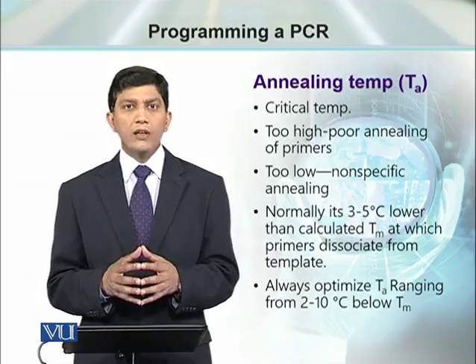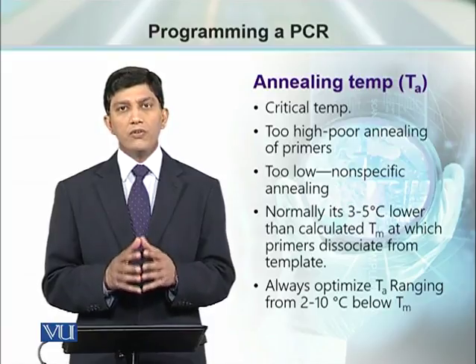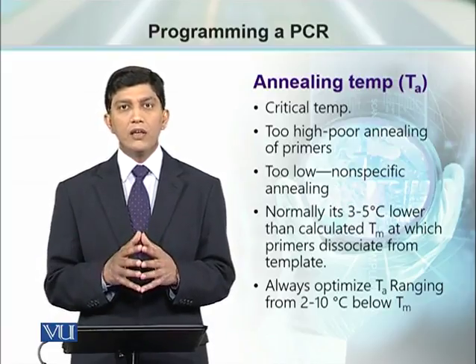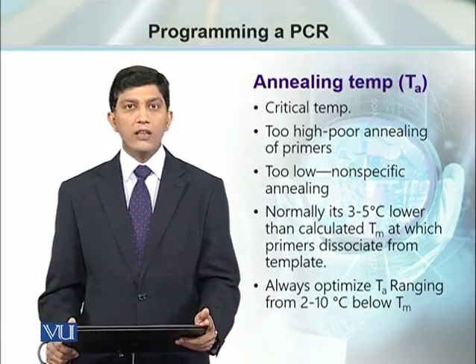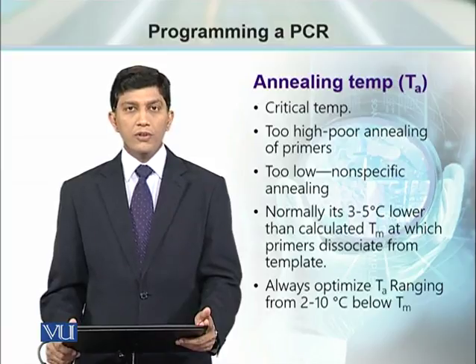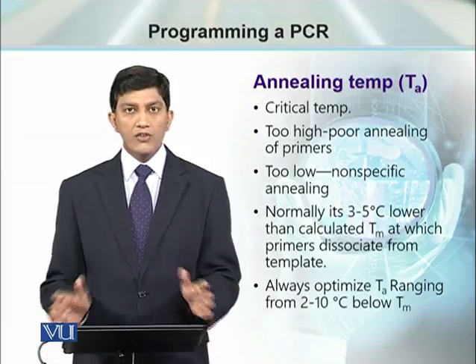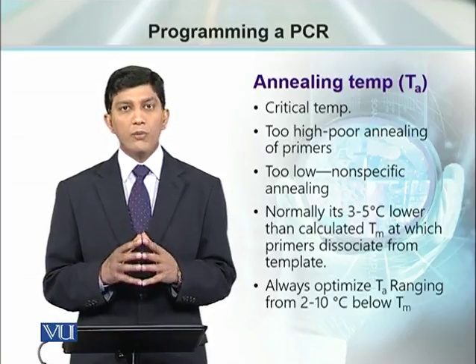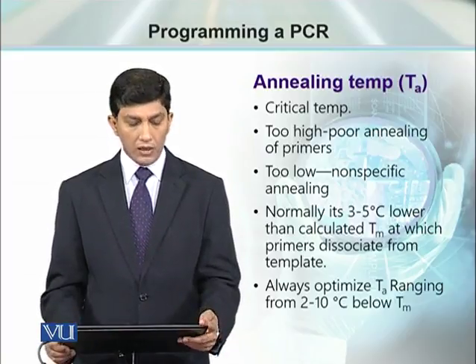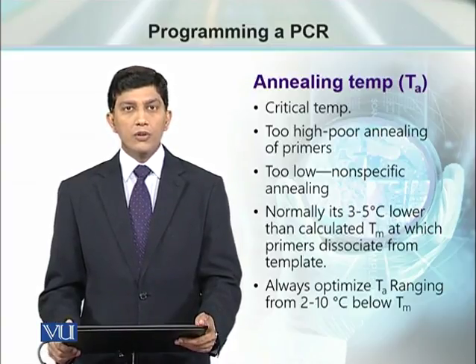Annealing temperature is calculated keeping in view the melting temperature. The melting temperature is the temperature at which the primers separate from the DNA template. Annealing temperature should be 3 to 5 degrees centigrade lower than the melting temperature, and if the results are still not clear, we have to try a range of temperatures 2 to 10 degrees centigrade below the melting temperature. We have to optimize the annealing temperature in multiple PCR reactions, keeping in view the sequences of bases in the primers.